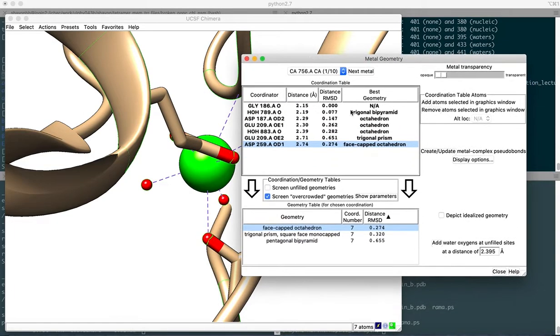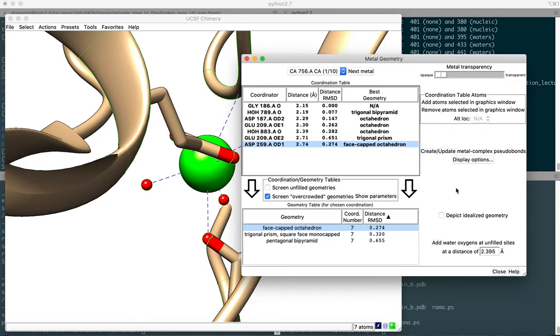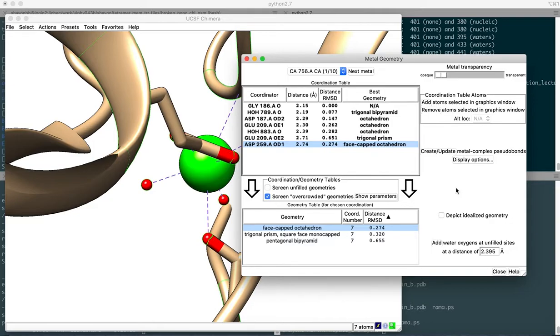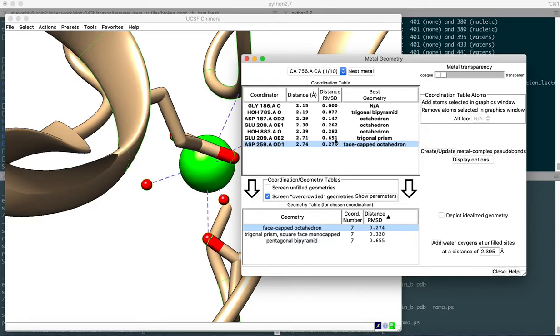Another thing that this metal geometry feature has in Chimera is depicting the idealized geometry. This is also a test for validation of the metal geometry. Once you resolve a crystal structure, you assess the geometry and it might not be correct. It might deviate from idealism, but it doesn't have to be ideal as long as the root mean squared deviation of these geometries are within range. Let's say 0.2 angstroms or even 0.65 angstroms are not that big of a difference. So this is fine.